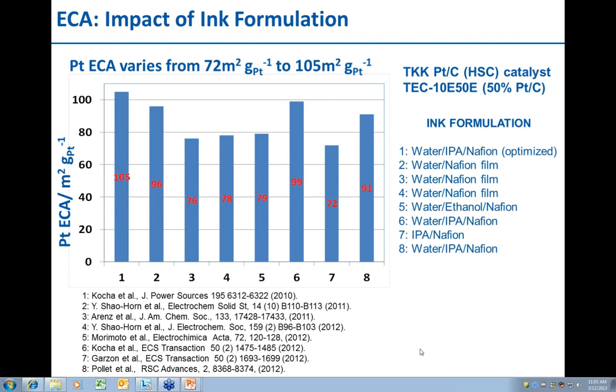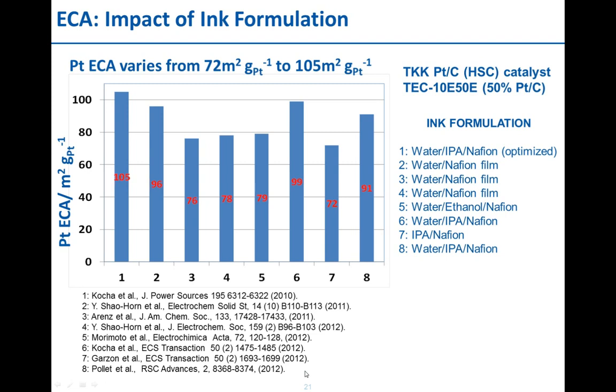Well, I think if you keep your platinum loading between, I would say, 10 to 25 microgram platinum per centimeter squared, you should be okay. And again, if you do Levich analysis and things like that, you can see if your film is too thick, because your limiting currents are not going to be what is predicted by the Levich equation. So that's a guide you can keep when you make your films, making sure you get the right limiting current and things like that.